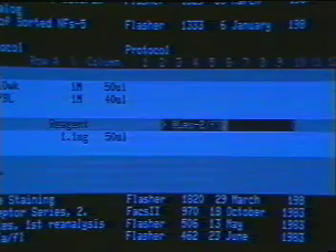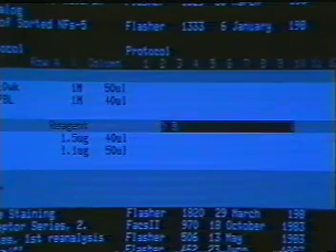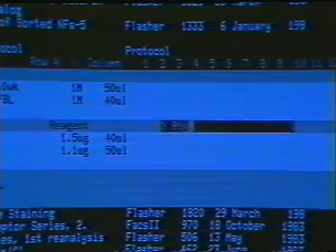Now we'll add a few more reagents to the fluorescein list. Obviously, this sample protocol couldn't be used for a real experiment. The cells and reagents have been chosen to show examples of different types of answers to the prompts.